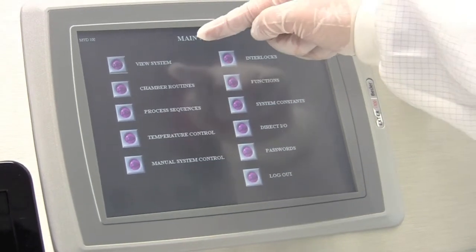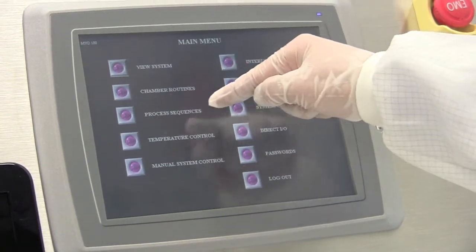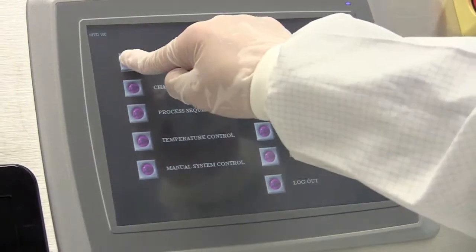For the general users, we will use view system, chamber routine, process sequences, and temperature control. Before we start, we will view system first.